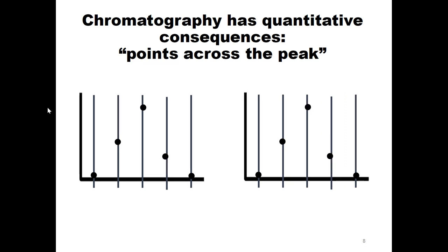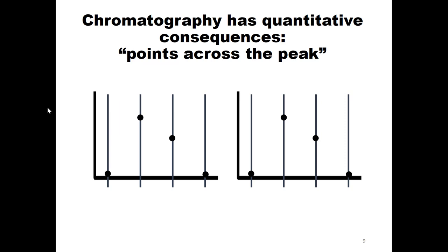So I gave you a copy of this on the right, so you can, either with a pen or just on your computer, draw a line connecting all these points, and you get the shape of the peak. But that's what Skyline's doing for you. It's interpolating between all these points to draw that chromatogram. But what's actually coming off your instrument is what looks like this.